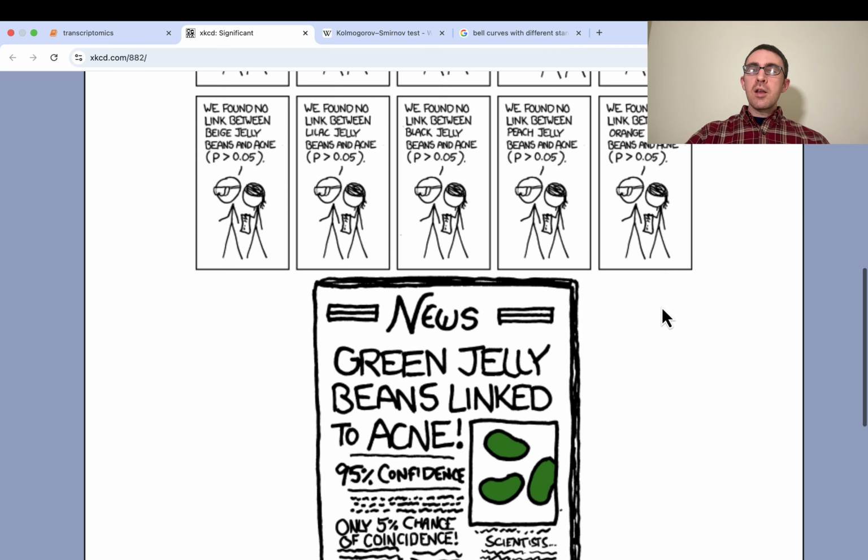The other thing is that I originally didn't like that this epsilon trick basically changes the numbers. So it changes the fold change to be something other than what it actually is. But then I realized that it actually changes things in a way that makes this measurement even more conservative and even less likely to give us false positives and falsely identify a gene as being different when it's not actually different.